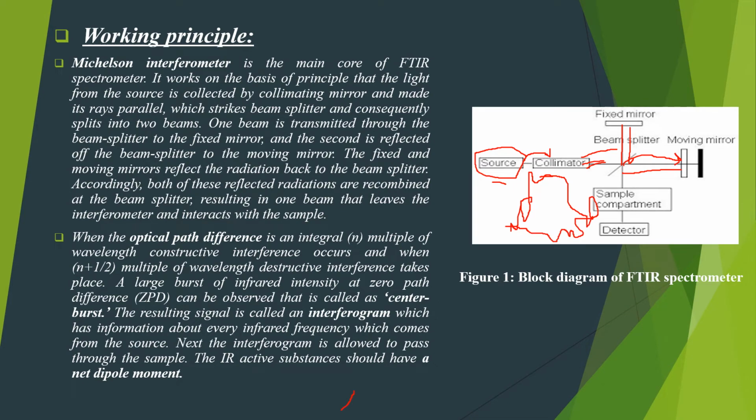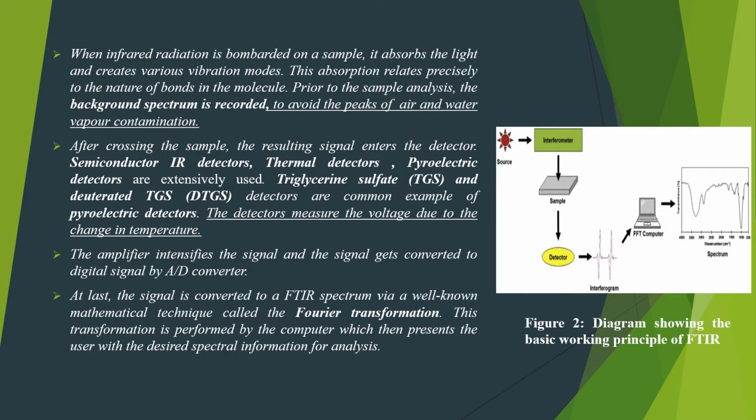So here, then this light will go to the sample compartment, and the IR active substances should have a net dipole moment. This is the most important condition for IR spectrum. Let us go to the next slide. When the light goes to the sample, it comes out.